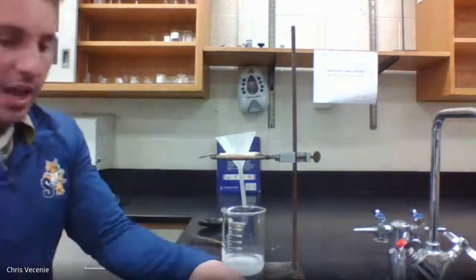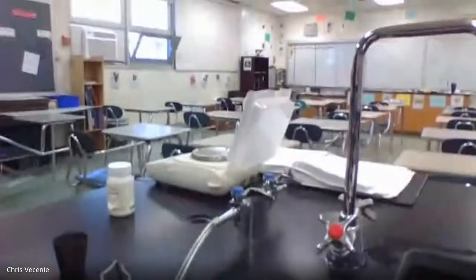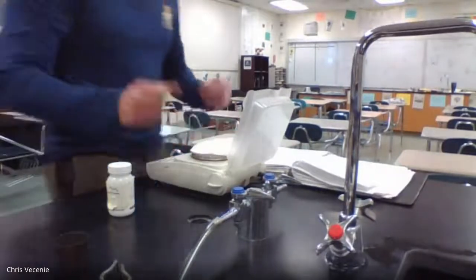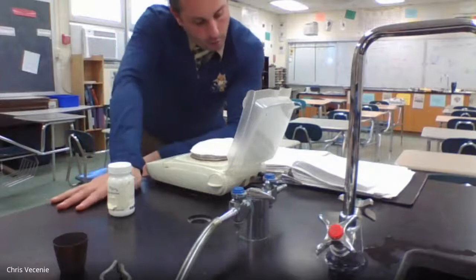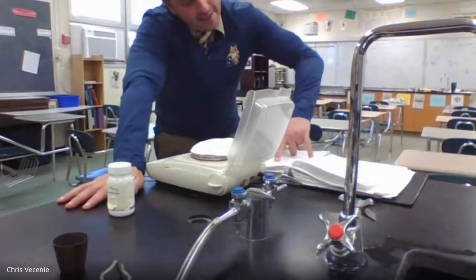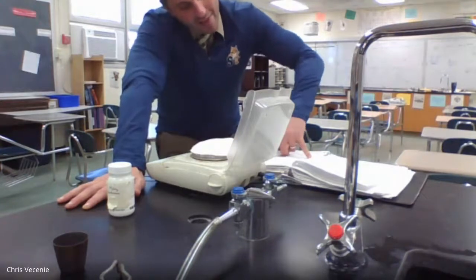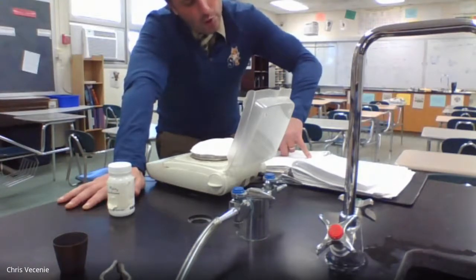I'm going to take you over to the balance one last time. I would come over with this and put it on my balance, and I'm going to give you that number. What we're recording right now is the CaCO3 with the filter paper. We're about halfway down the table, and that number, with the CaCO3 on it, is looking like 2.19.